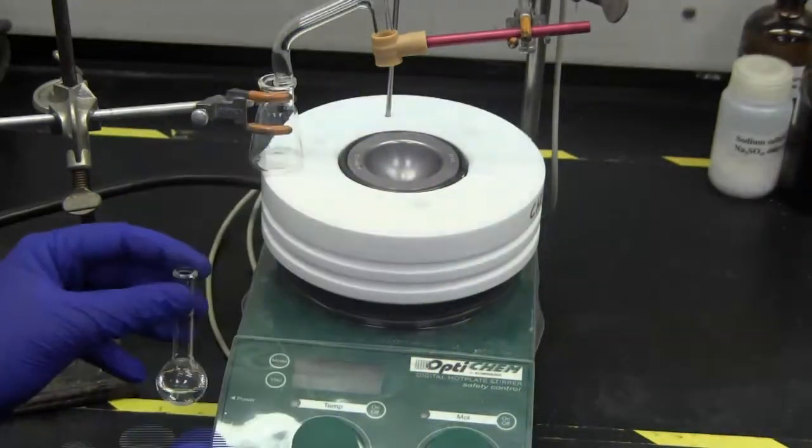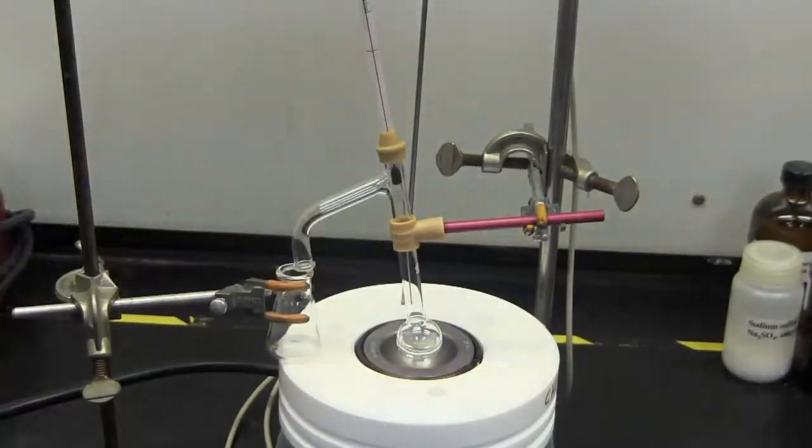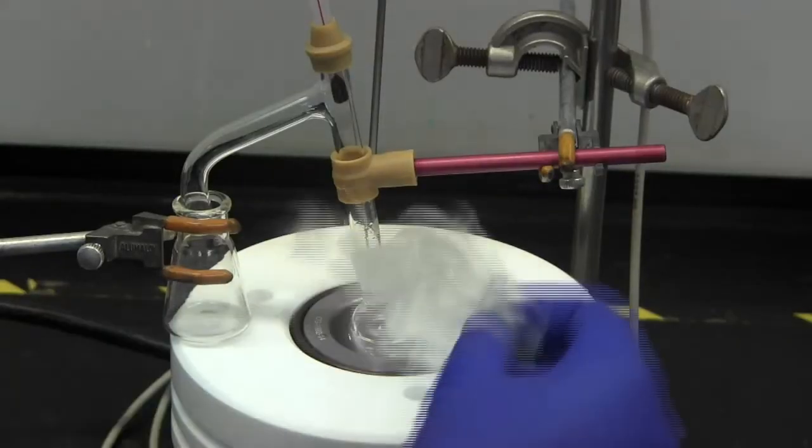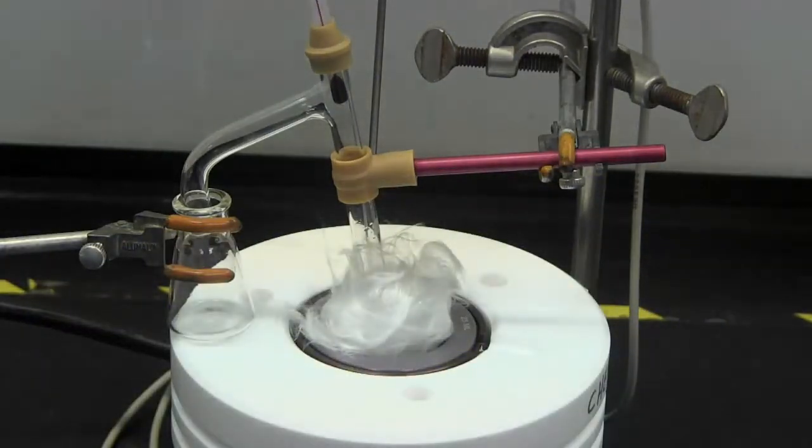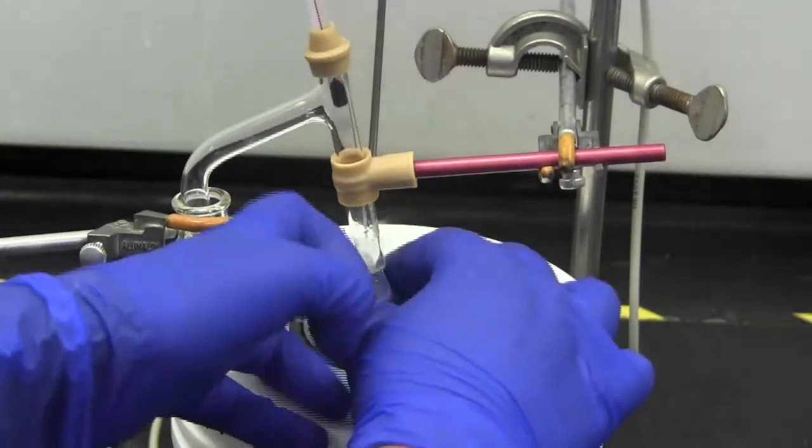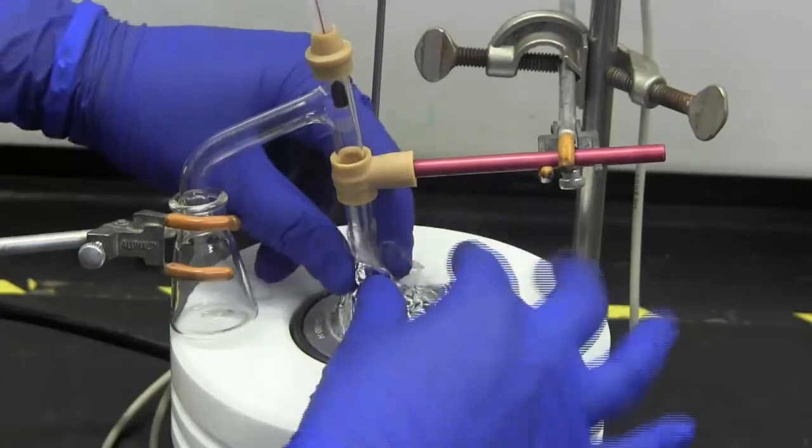Now place your sample in the round flask and insert it into the rubber fitting to complete the setup. Wrap the glassware loosely with aluminum foil. Make sure that there is no foil underneath the flask. The goal is to trap as much heat as possible.